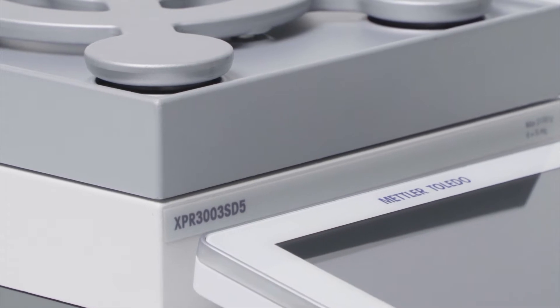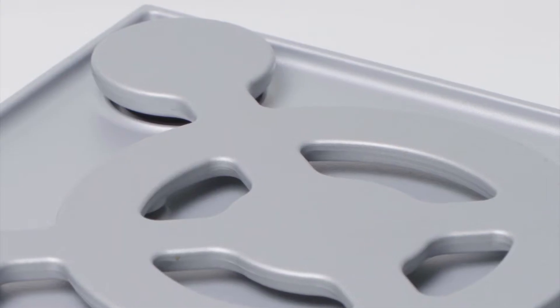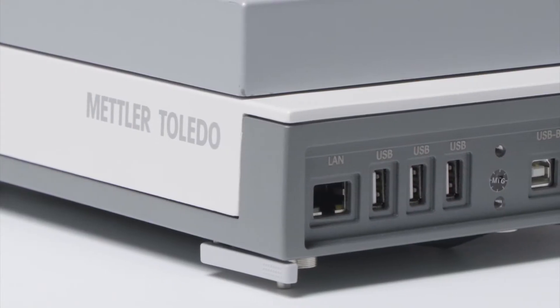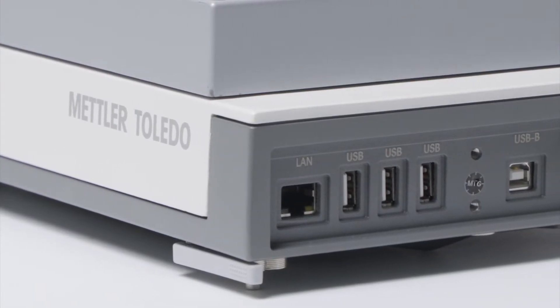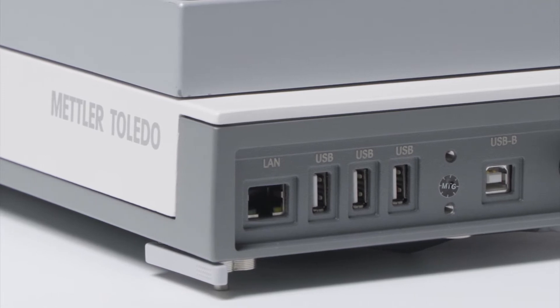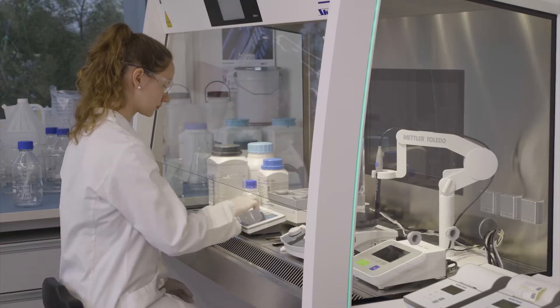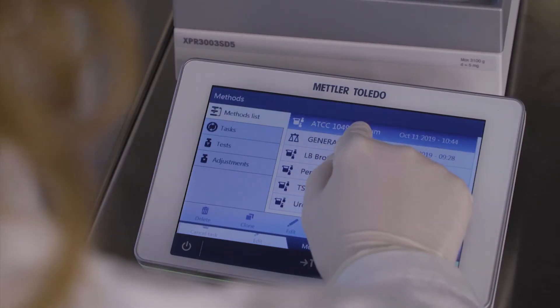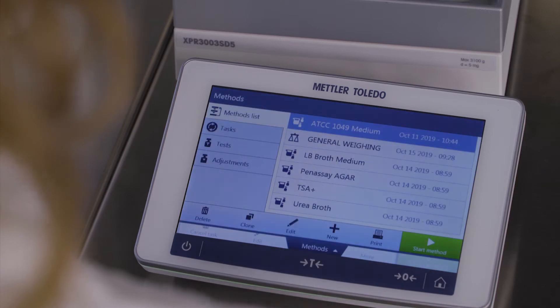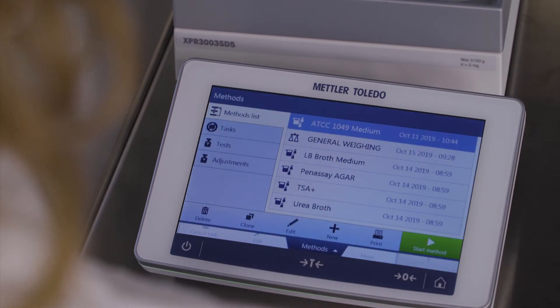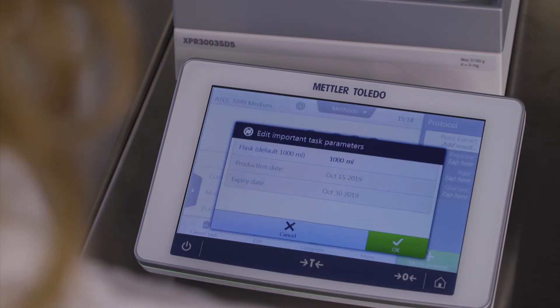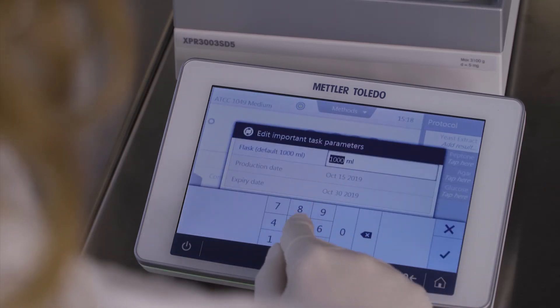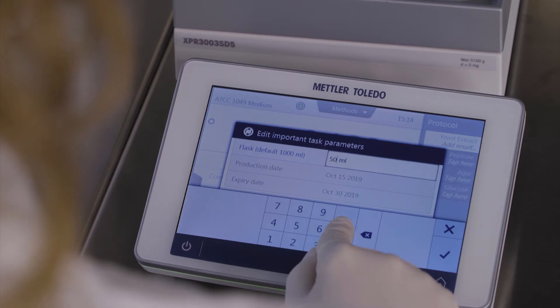Mettler Toledo's XPR precision balances support you to accurately prepare different culture media recipes. Simply select the formulation recipe from your method list and enter the target amount. The weights of all the individual ingredients are recalculated automatically.